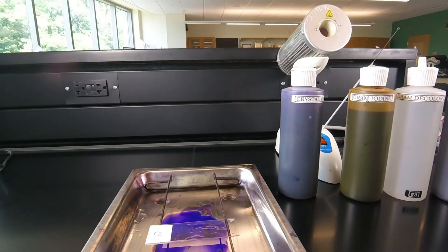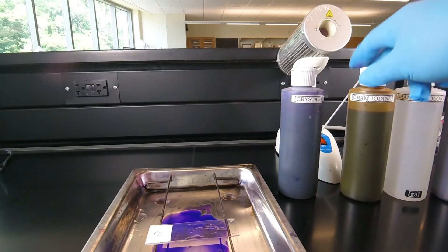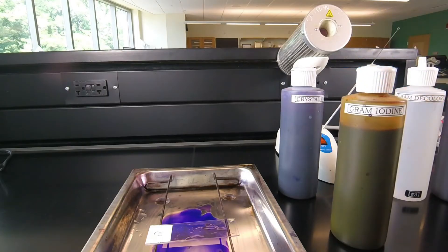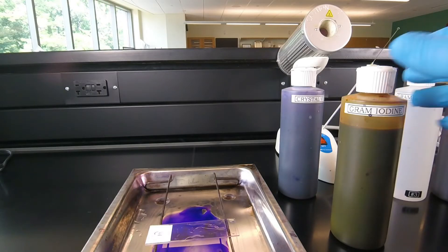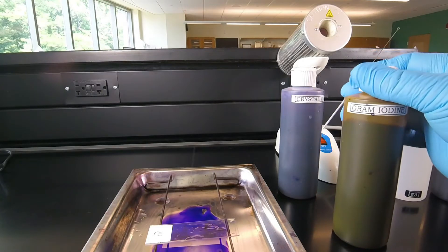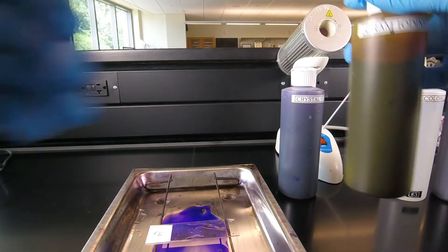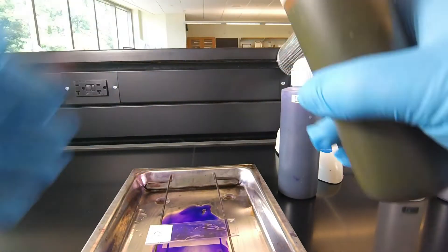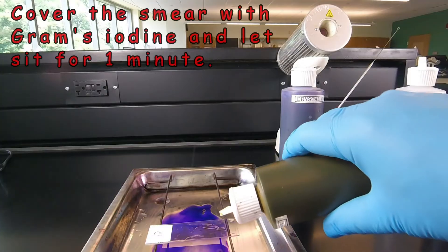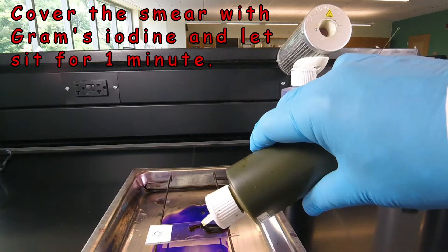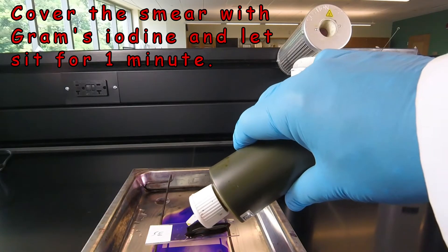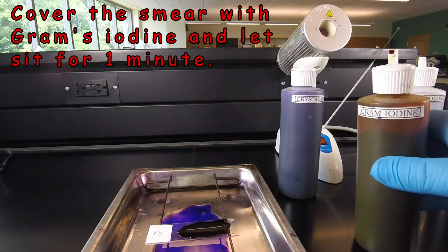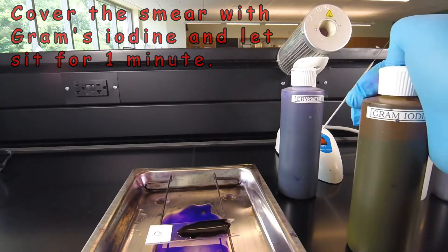The next step is to treat the bacteria with Gram's iodine. The Gram's iodine combines with the crystal violet inside the bacteria to form a water-insoluble crystal violet-iodine complex, and it helps the bacteria retain the crystal violet better. We add enough iodine to cover most of the smear, and we're going to let that sit for one minute.